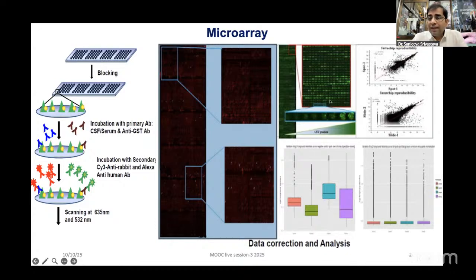A lot of data analysis and data normalization was required before one could make any meaningful sense of the data. But eventually we could identify 4 autoantibodies, which are a very powerful signature for looking at progression of the disease, and one could predict quite early from the blood signature. So that was something interesting which came out of the protein microarray to look at autoantibody.